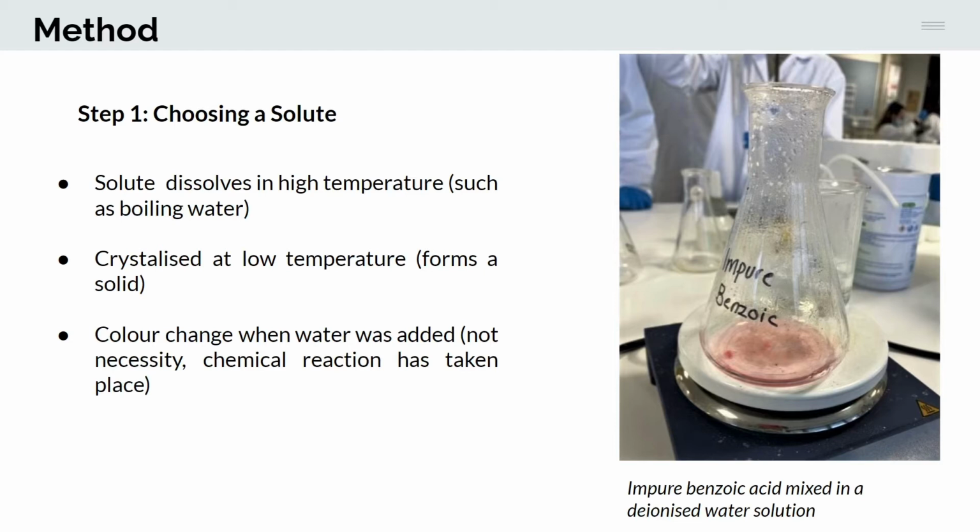The video in the following slide depicts the color change seen when the impure benzoic acid is added to the hot water in the conical flask and stirred to help with dissolving.